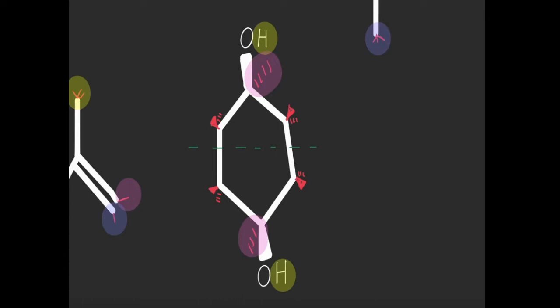So we're going to have to be careful with this one and show that these hydrogens are the same, the blue signal, the ones that are dashed, but these hydrogens are not the same, the ones going out in the back, because, unlike the wedged ones, these dashed ones are going to be experiencing the dashed hydrogen. They're not going to be seeing the OH. So I'm referring to it as what are they seeing, but if you want to be really technical, it's all about having a different environment, which will give you a different chemical shift when you're looking at a spectrum.